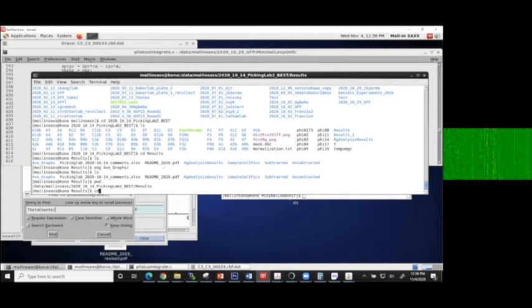This would be sort of examples of proteins in solution, or macromolecules in solution that have constant electron density. So they're homogeneous in density. The challenge with lipid particles is that the electron density is not homogeneous. The phospholipid head groups scatter way more than the aliphatic tails. And so you see mostly the head groups. That's a particularity of that kind of a system or detergent system.